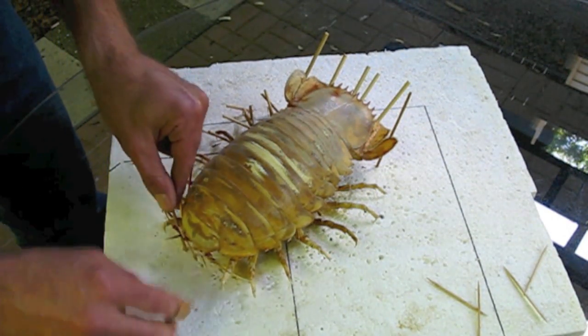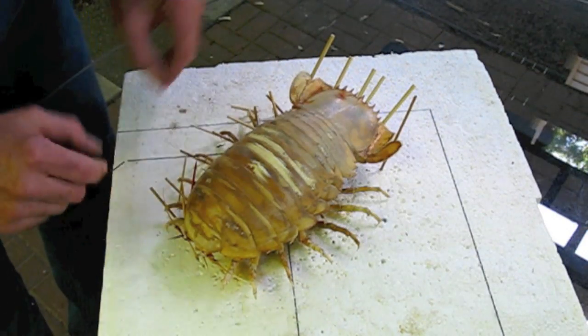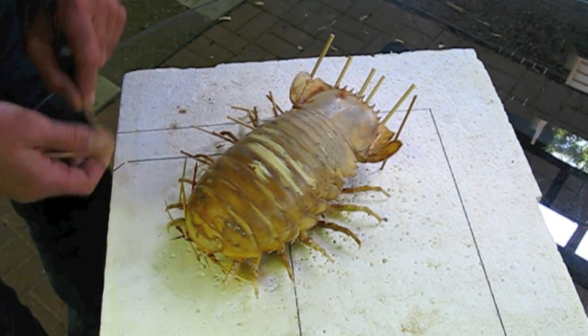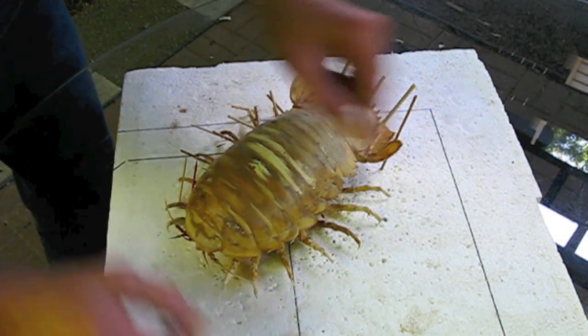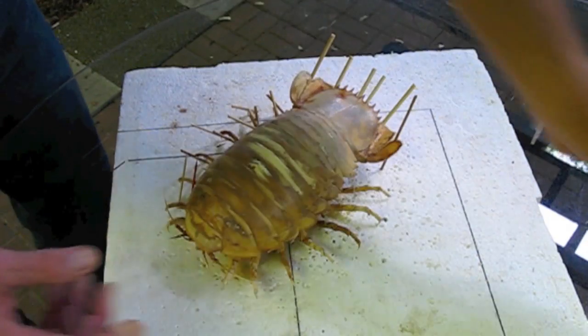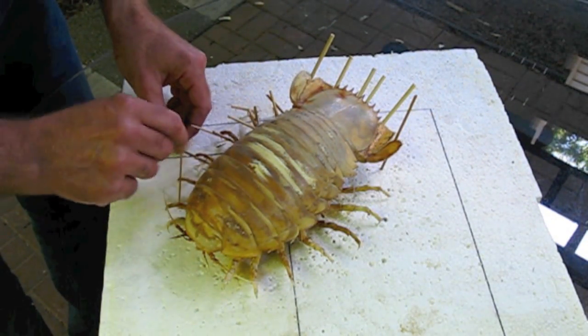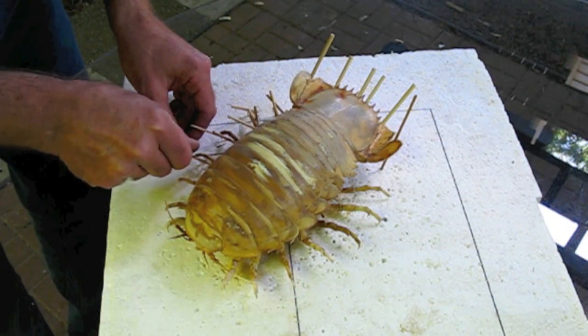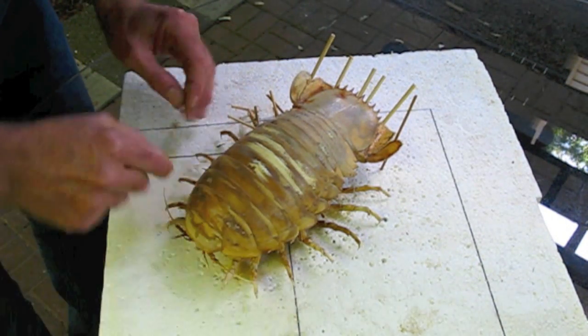We do see some discoloration here on the carapace, and that's not unusual. We have a treatment for that — silicone mixed with alcohol, which I'll paint on the exoskeleton. That will soak in and smooth out those discolorations.